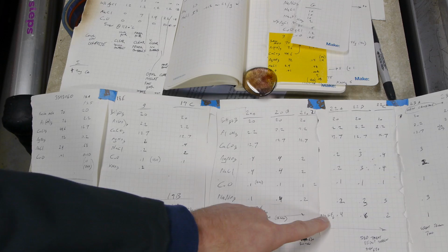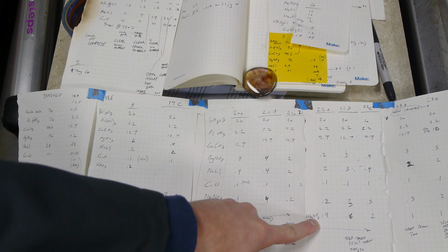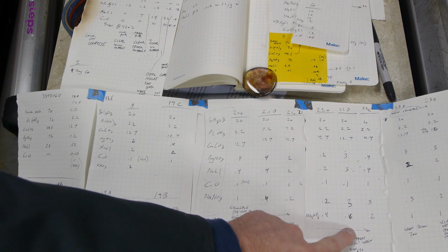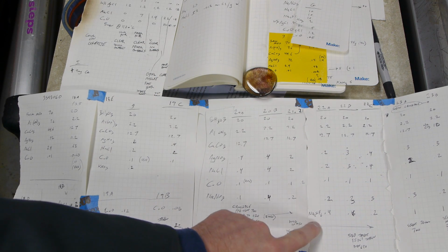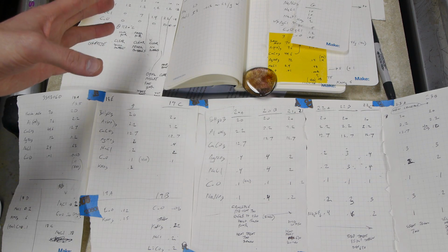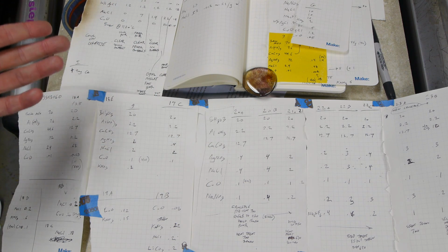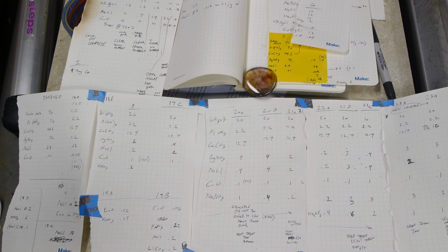And then finally, I'm not sure if this is critical or not, I started adding sodium silico fluoride to some of these batches, and the winning batch actually did have a little bit of sodium silico fluoride. And the idea with this is that it provides a nucleation center for the silver chloride to form. So the trick with this heat treatment after making the glass is that we have these silver chloride atoms distributed throughout the glass. It's sort of like a photograph, but it needs to be clear in its clear state, so there can't be too many of these silver chloride atoms or molecules.